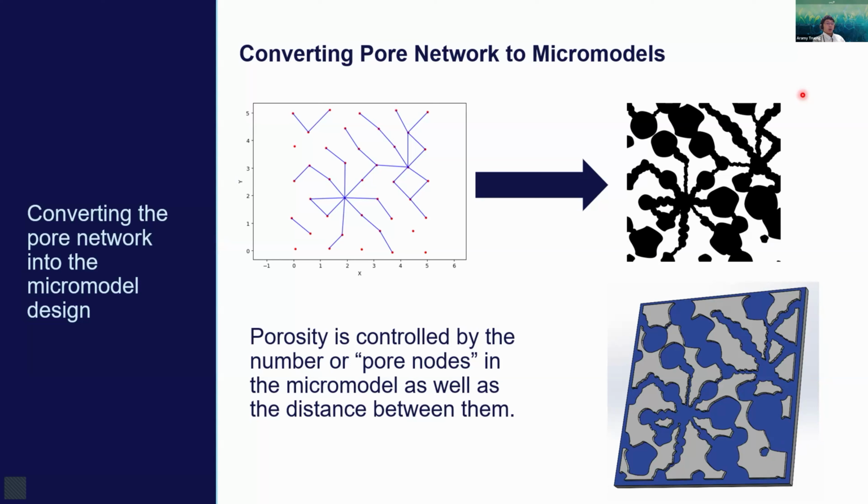And it's at this point that I wanted to talk about how we're controlling the overall porosity of our final micromodel. So let's say, for example, we did our analysis on the XCT core, and we know that a percentage of that whole volume, let's say 50%, was pore space or empty space. And we want to capture that in the micromodel. So in the micromodel, we want 50% to be pore space. And with this method, well, you don't control that necessarily. You can manipulate the generation terms to have 50% porosity.